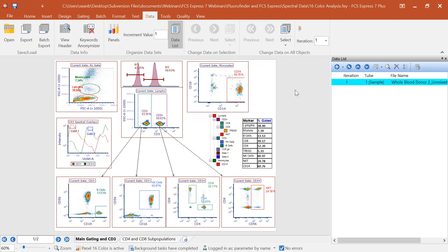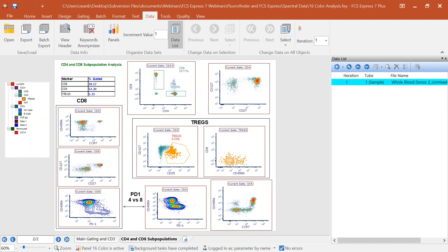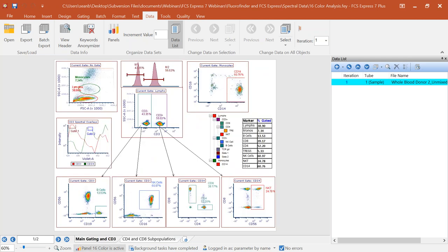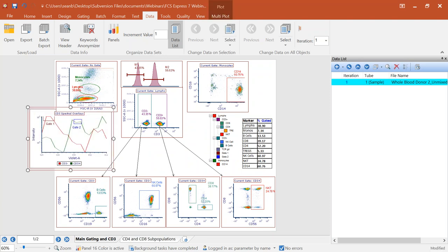Spectral cytometry does have a spectral component that allows a lot of additional capability for working with dye combinations you may not have been able to do in the past, as well as opening up the number of markers you can work with at the same time. There are a lot more markers pulled in from the Cytek Aurora system than from the standard FACSCanto instrument. When working with spectral data in FCS Express, there really isn't much special you have to do — you can create basic plots and charts just like we did with a conventional cytometer.